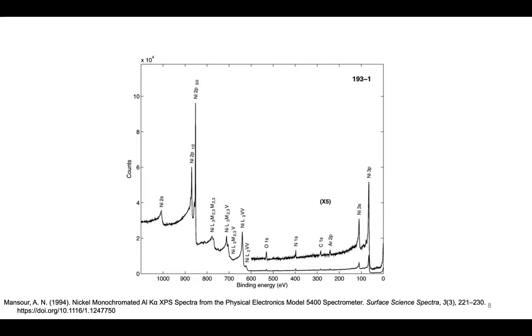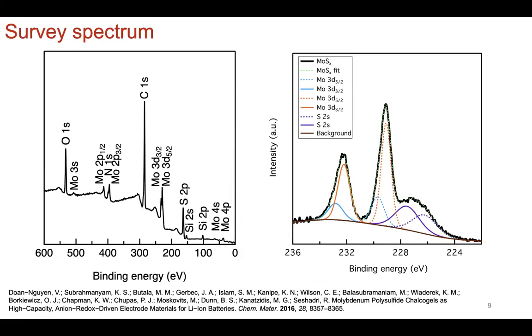And for the detection, you can see by the intensity that it gets smaller and smaller, and the binding energy gets smaller. There is a sensitivity limitation especially at 50 and below, so do that with care, which around 50 is also where lithium is. So lithium one has to really measure with care, especially if you're working on lithium-ion batteries. But that's the case for SEM, EDS, and any other characterization techniques that we've talked about.